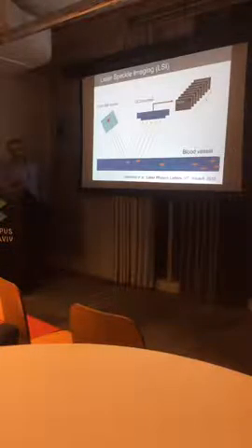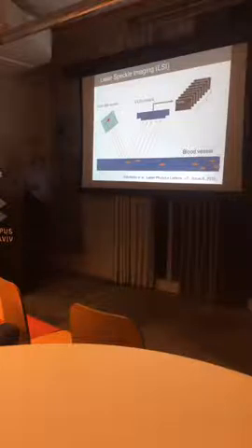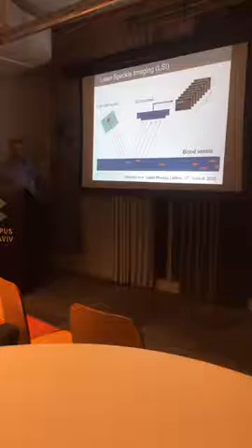If there is any flow, like red blood cells, when we illuminate the tissue and there is motion, after we collect the images, we can analyze the statistics of what happens in each pixel on the camera. So if we analyze these statistics, we can get an image.